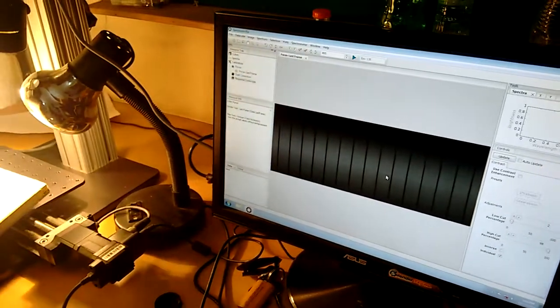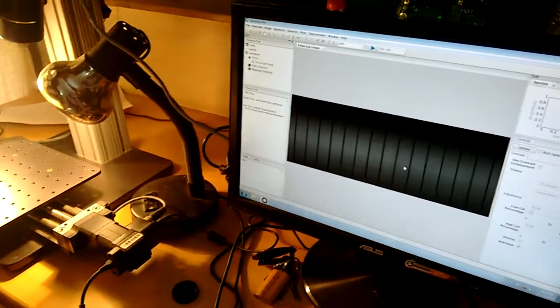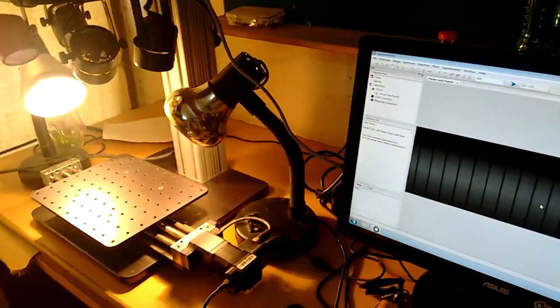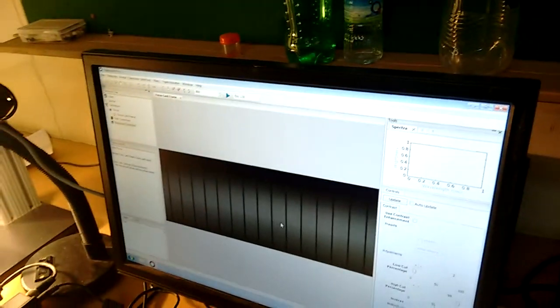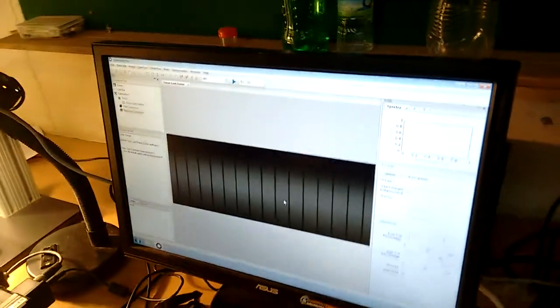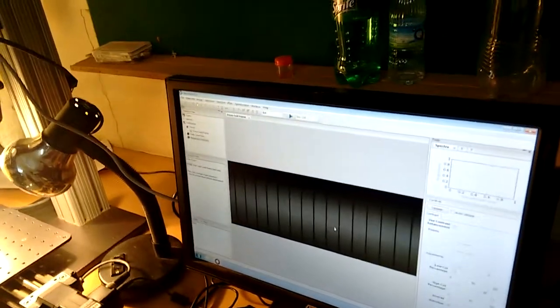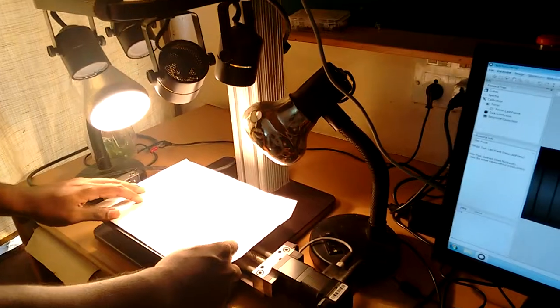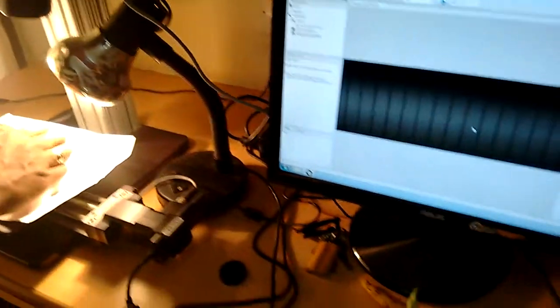Now I am having the instrument ready for my sample measurement. Now I will place a piece of paper and I will take all my samples here.